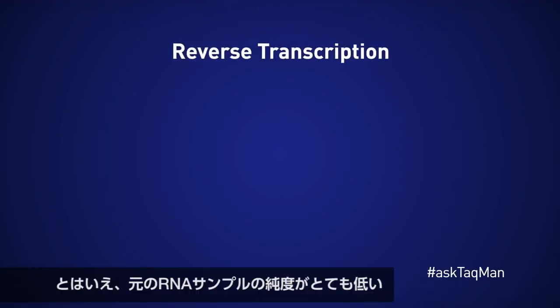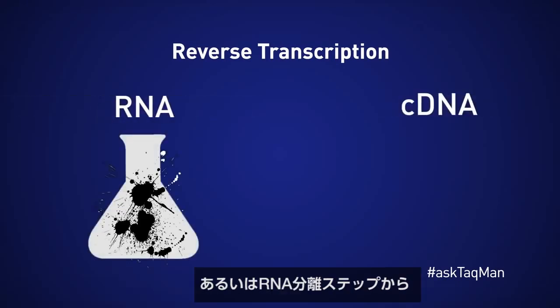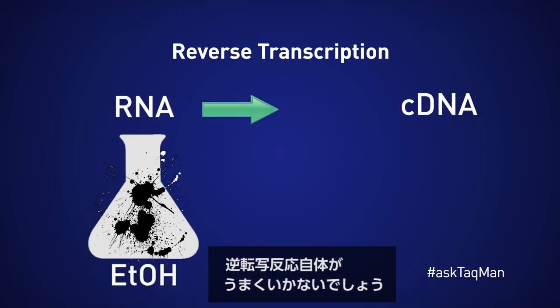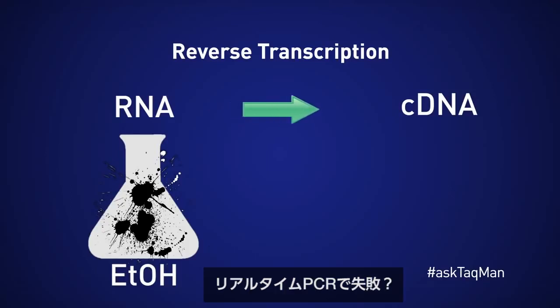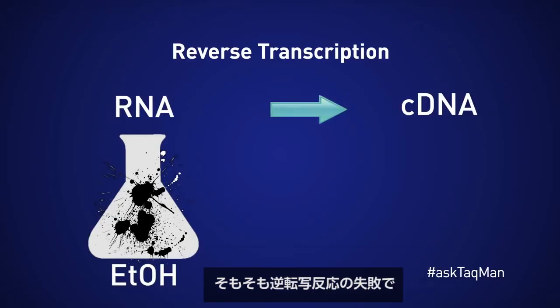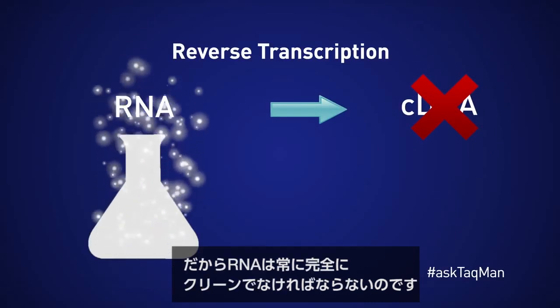That said, if the original RNA sample is really dirty or contains lots of residual chemicals from the RNA prep — such as ethanol — it's likely that the reverse transcription step itself won't be successful. So failed real-time reactions are often not caused by cDNA being dirty, but rather by an unsuccessful RT that produced little or no cDNA in the first place.